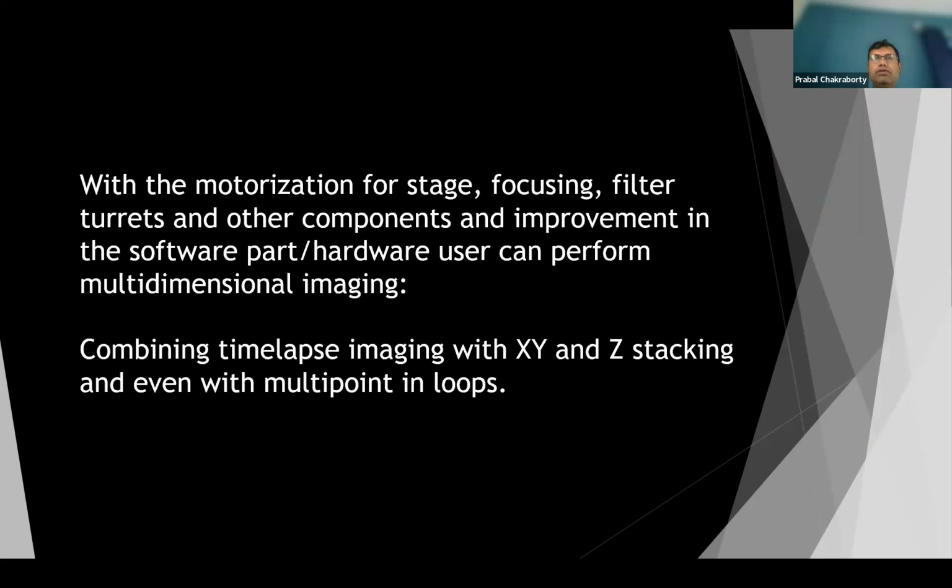This is just to tell you that with the modern day microscope, which is mostly motorized, all the components can be controlled with just a click of the software, and you can program the movement of the components. With a strong software and hardware combination, you can do multi-dimensional imaging: a single plane image, a Z-stack, or a time lapse image. Like, if you want to do live cell imaging for 1 hour or more, then let's say every 10 minutes you capture images to see how a dynamic event is changing inside the cell.